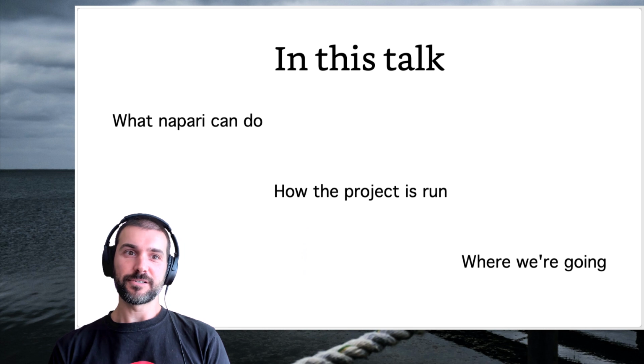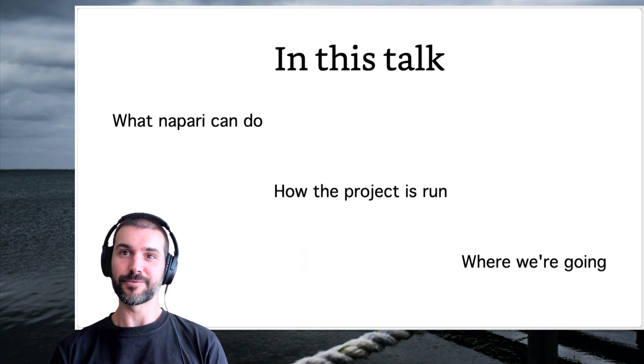So in this talk I'm going to tell you about what napari can do, and then I will tell you about how the project is run and where we're going with the project. And I'll tell you this in the hopes that you will also join the project and contribute to it.